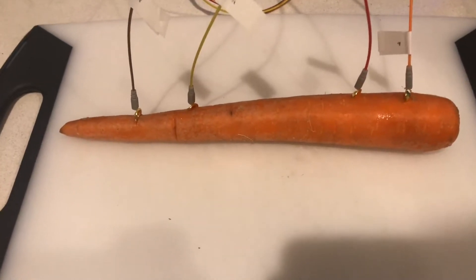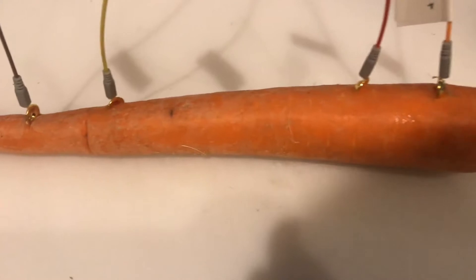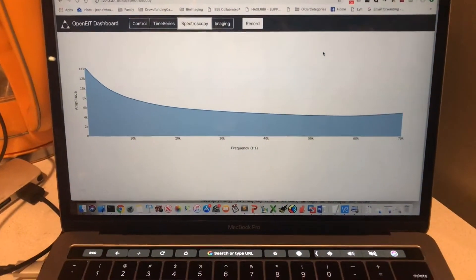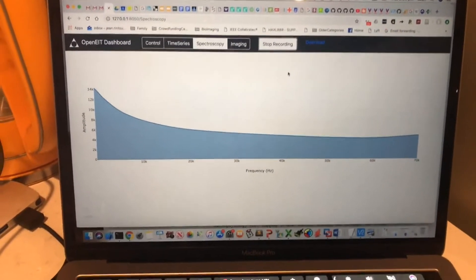And here we go — we've incised the carrot with the four electrodes and we get a spectrum right up here. I'm just going to hit record so that we can plot that one later.